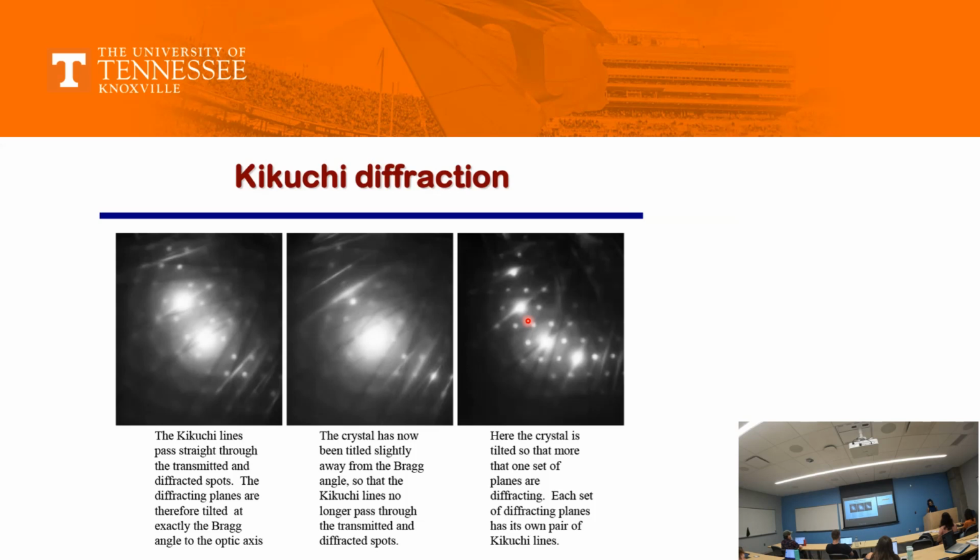So just to initiate your interest in microscopy, you should definitely go and Google about reciprocal lattice, Kikuchi diffraction pattern, elastic scattering, inelastic scattering, Fraunhofer diffraction, Fresnel diffraction, zone axis. These are very fundamental concepts.